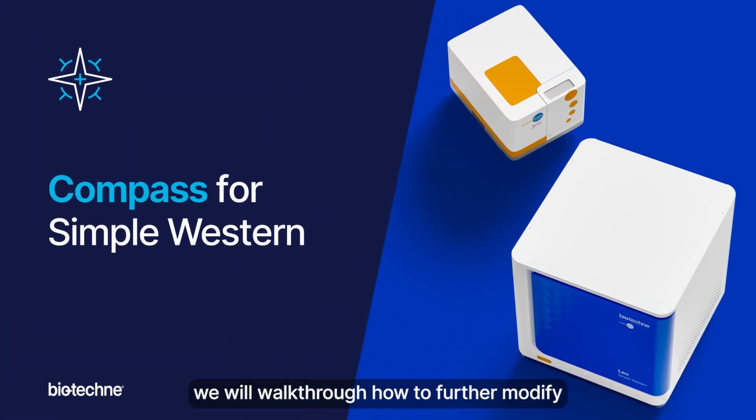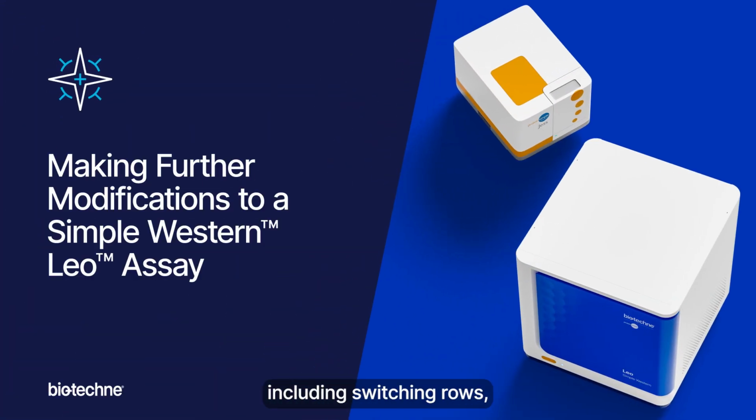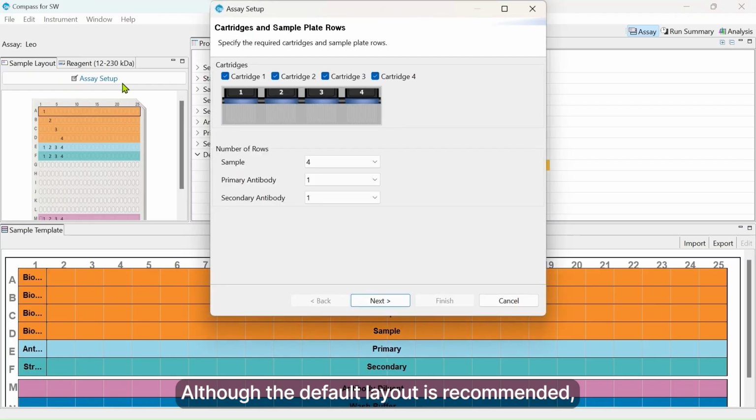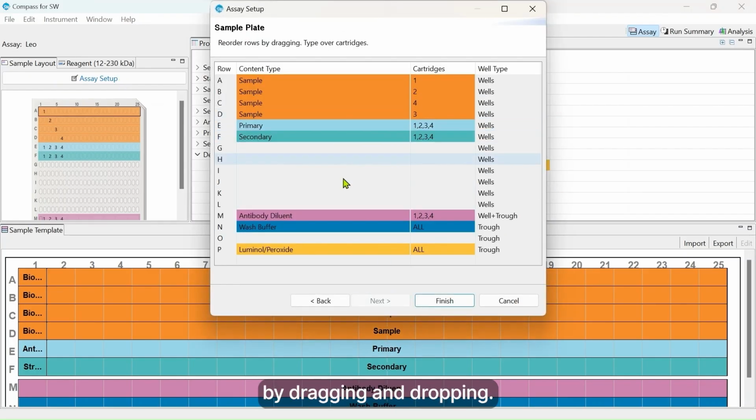In this video, we will walk through how to further modify default assay setups, including switching rows and adjusting the assay protocol to make Simple Western with Leo fit your needs. This can also be helpful when optimizing experiments. Although the default layout is recommended, in assay setup, you can move or switch rows by dragging and dropping.